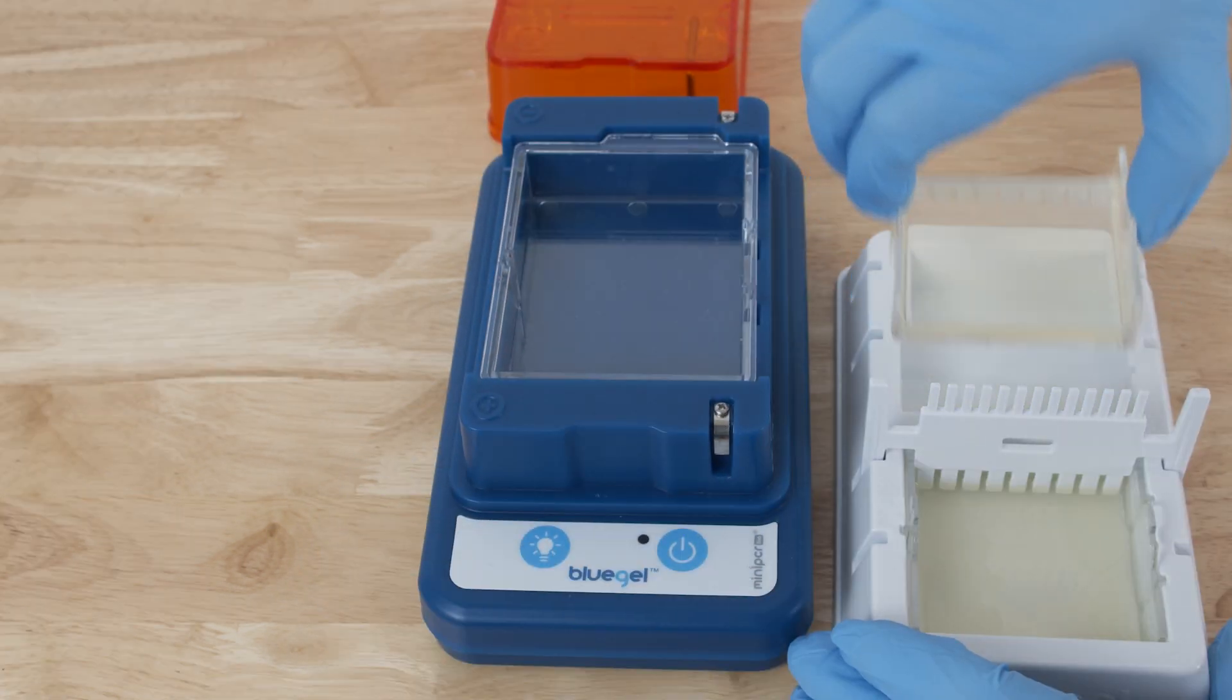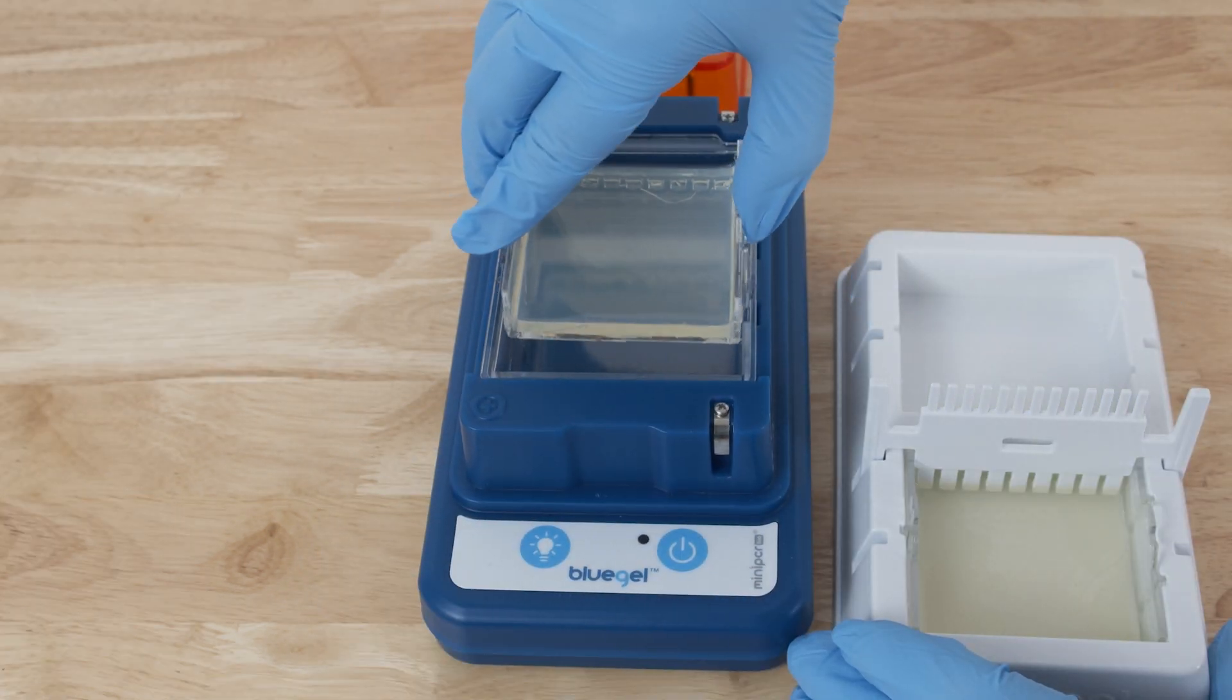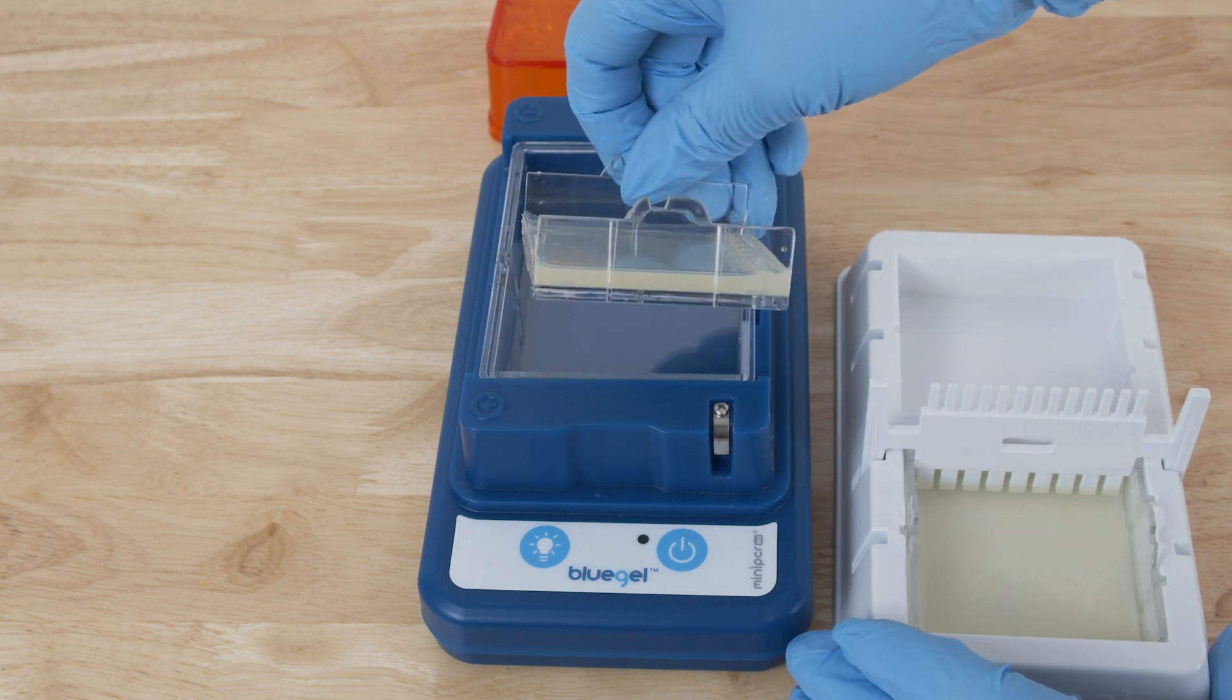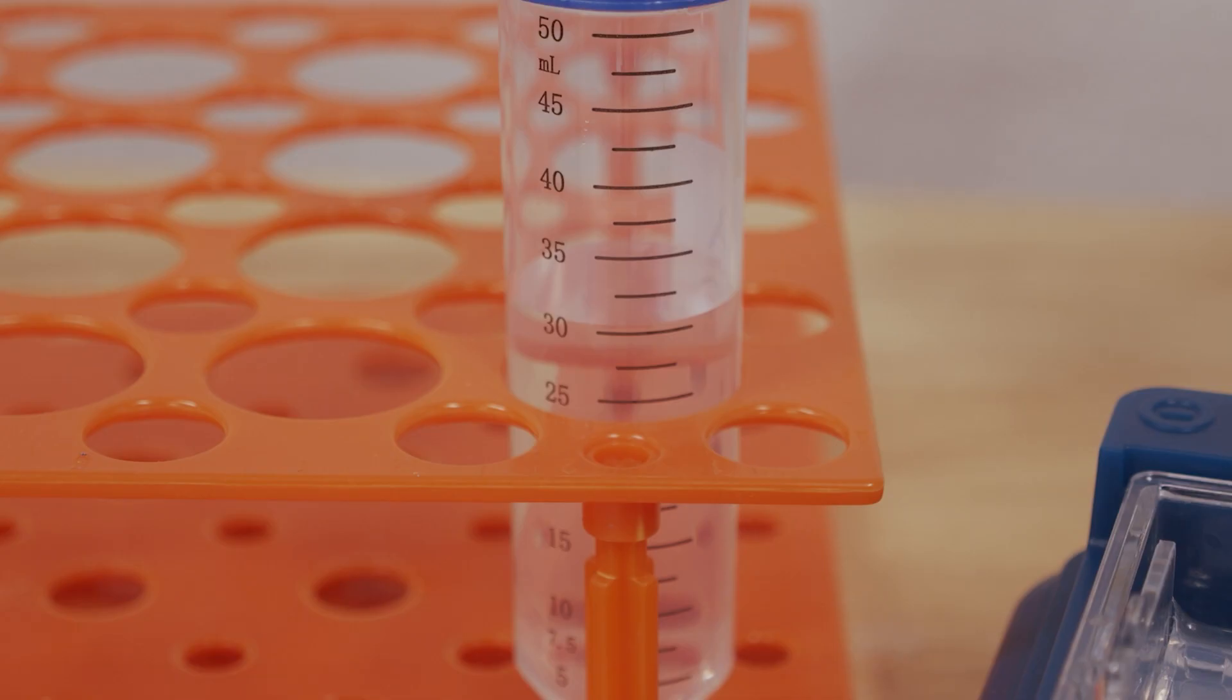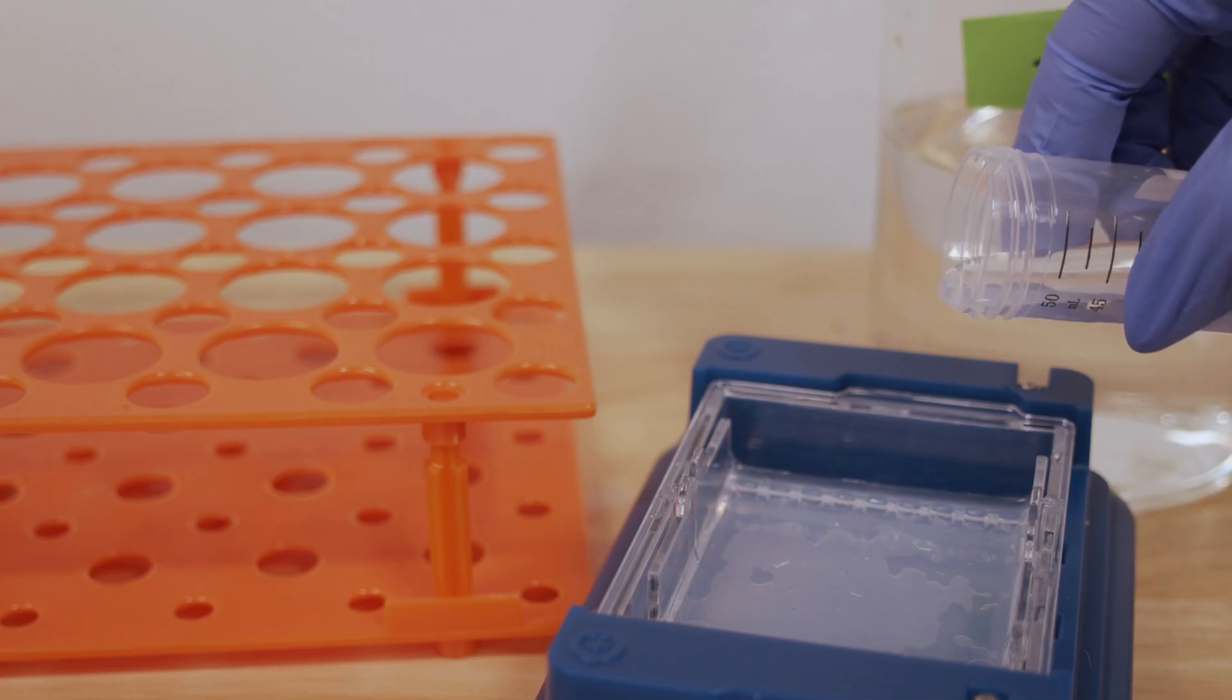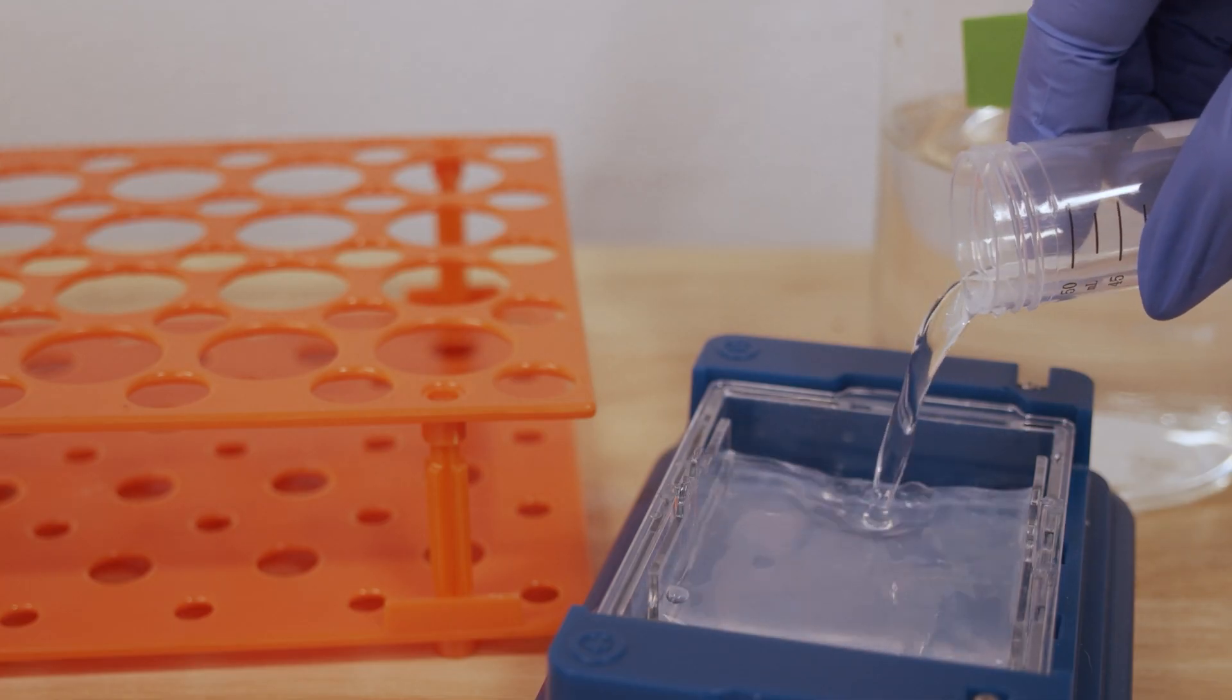Then add the gel tray containing the gel into the buffer chamber. It too will only fit in the correct orientation. Add 30 milliliters of TBE buffer to the buffer chamber. Buffer should just cover the top of the gel.